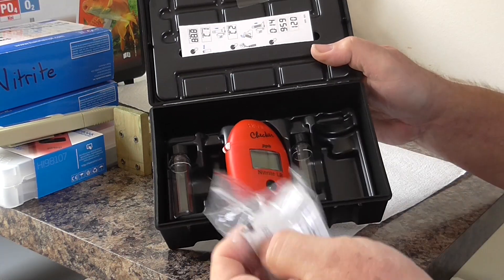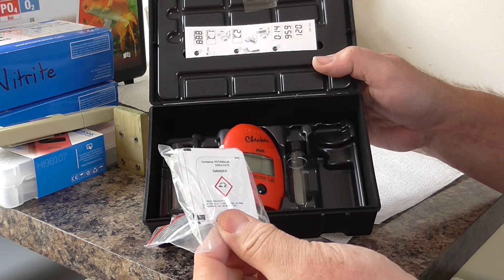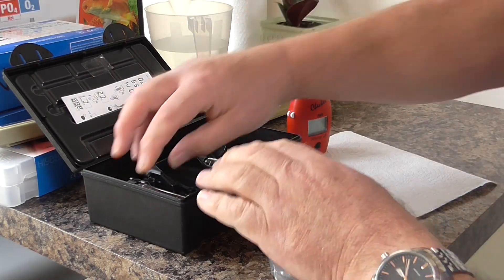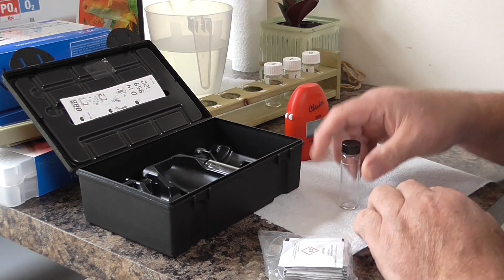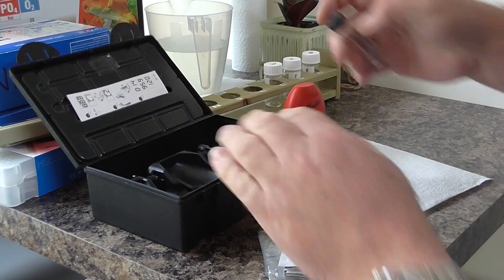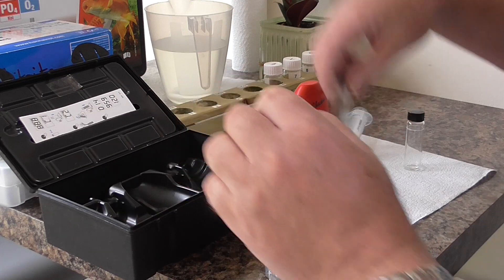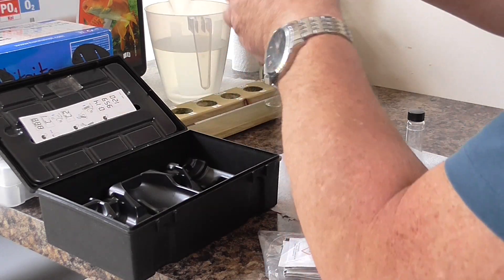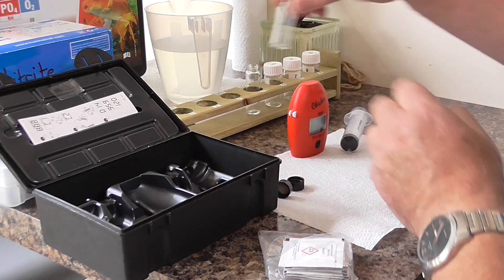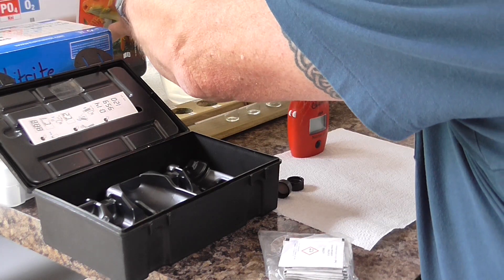Here's the kit: two test tubes, the checker, and some reagents. Take the two test tubes out and fill them with 10 millilitres of pond water.